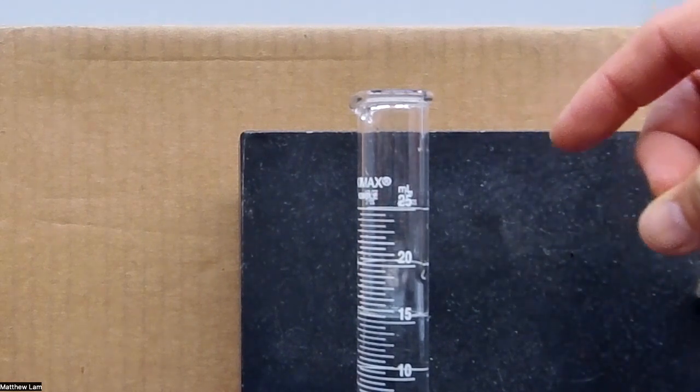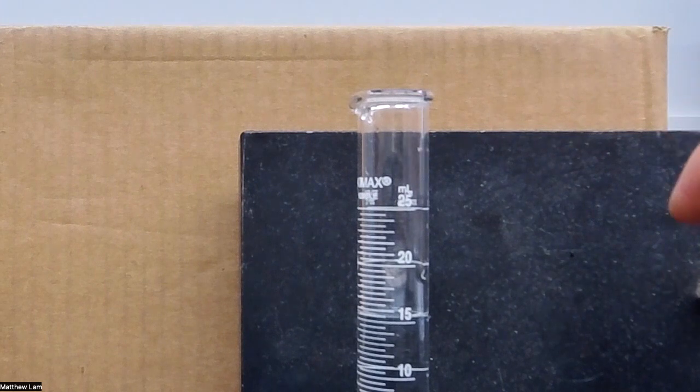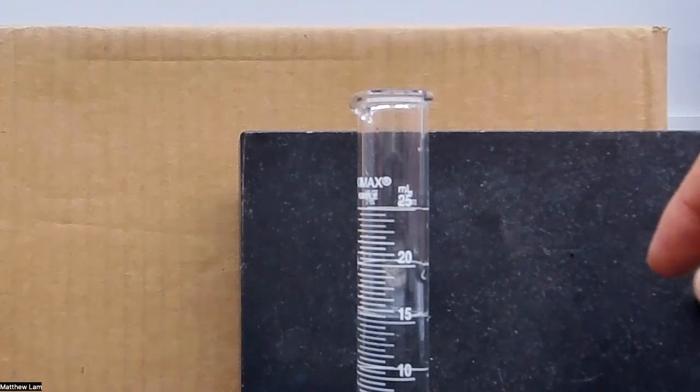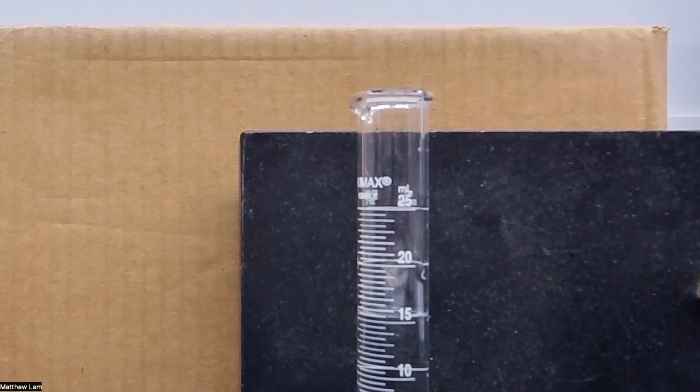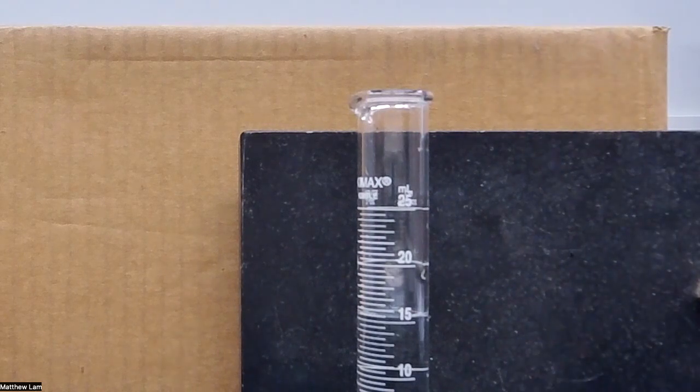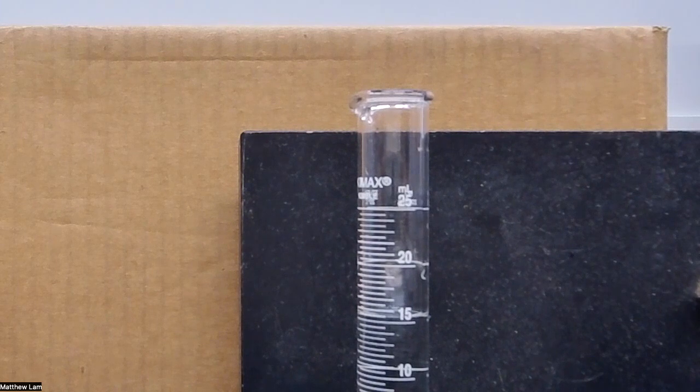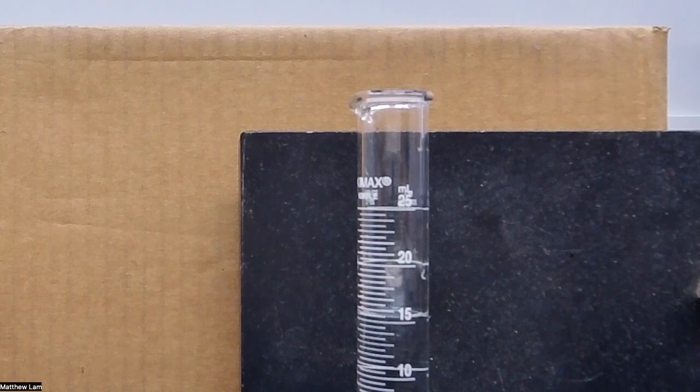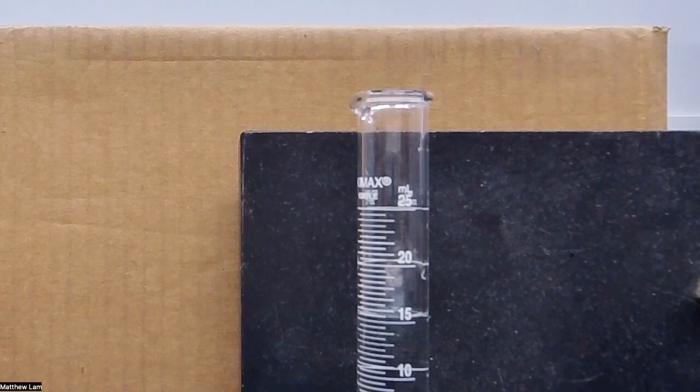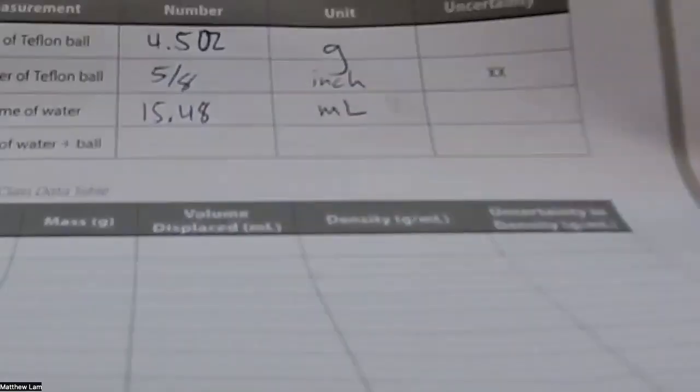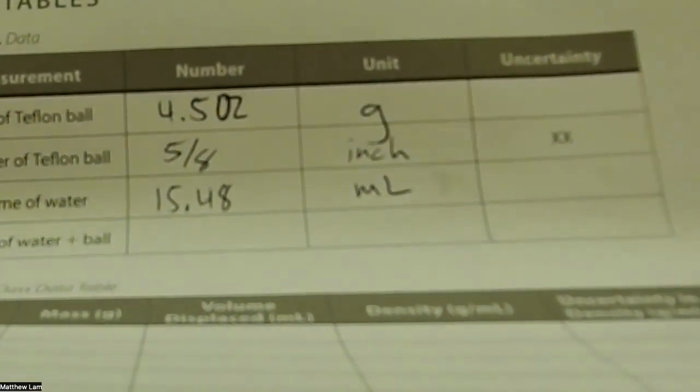And so if I was to read this, it looks like—I know it's a little hard to see—but it looks like it's just under 15.05 mils. So I'm going to just go ahead and guess that it's around 15.048 mils. So 15 point, excuse me, not 15.048, 15.48, and then mils. And so in my manual, this is a measurement I have before I throw in the Teflon ball. So 15.48 mils.